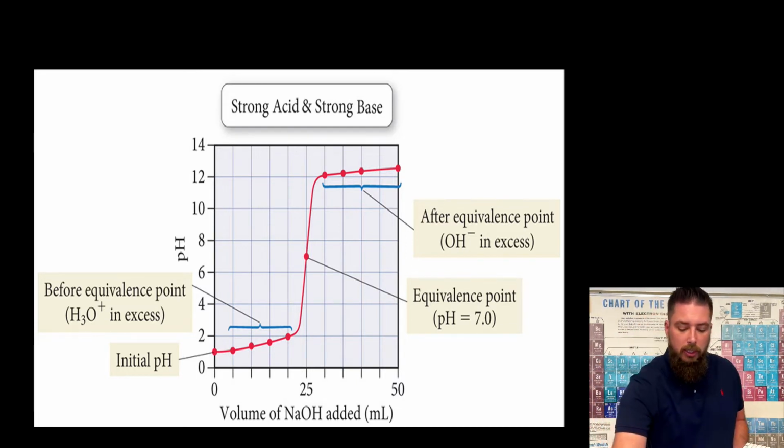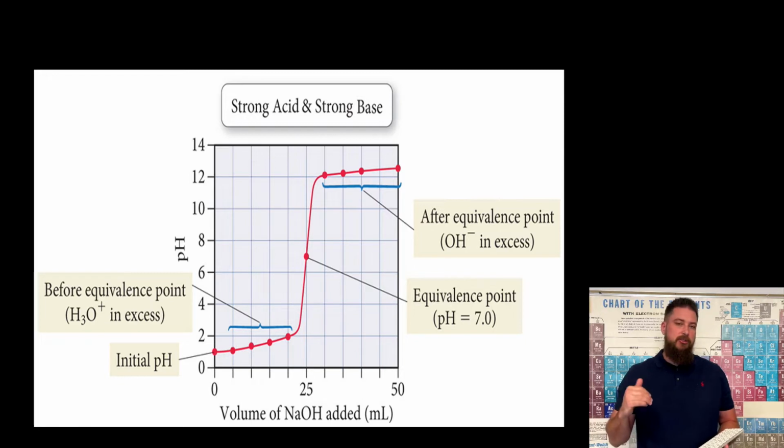As we were adding base to it, well, before we started adding base, what was the pH of it? Well, it was an acidic solution. So notice how if we were to be graphing this, it would start off somewhere in a pH that is acidic.